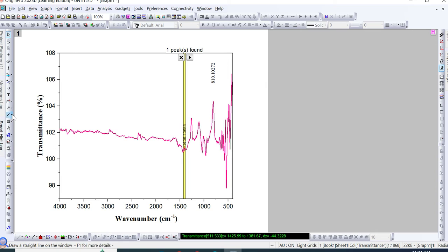For example, if I want to manually add lines, I will go to this menu bar, and from this I will select this line tool. After clicking on the line tool, you can select any curve tool or arc tool. It's just like the insert option we use in Microsoft Word. In that version, you also go to insert, then select shape, and then draw that shape in your Word document. Similar is the case with this Origin.